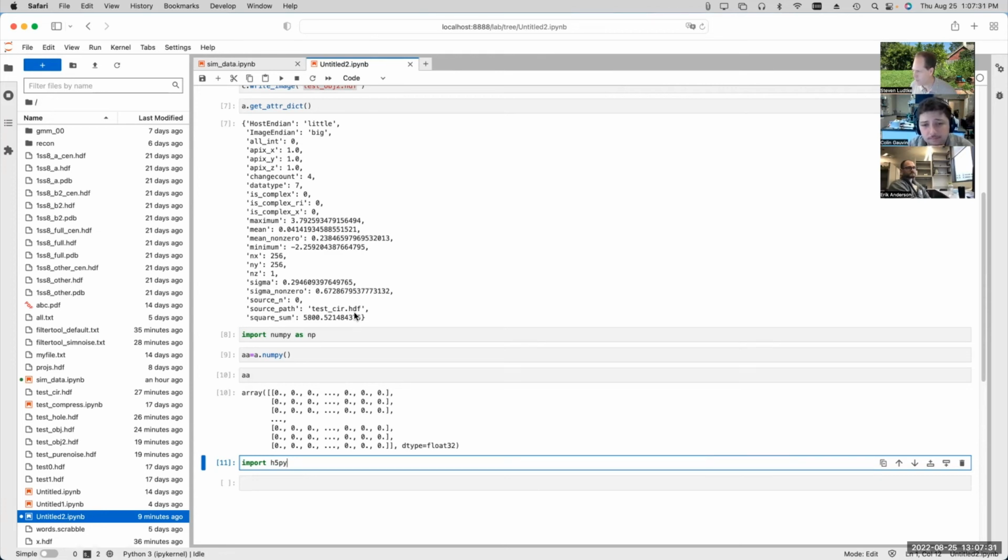Okay, raw movies, either you use the file format provided by the detector vendor. So, for example, if you're using a Falcon 4, they've got the EER format, which already does very nice compression of the raw count data. Or compressed TIFF is a very reasonable way of storing it.